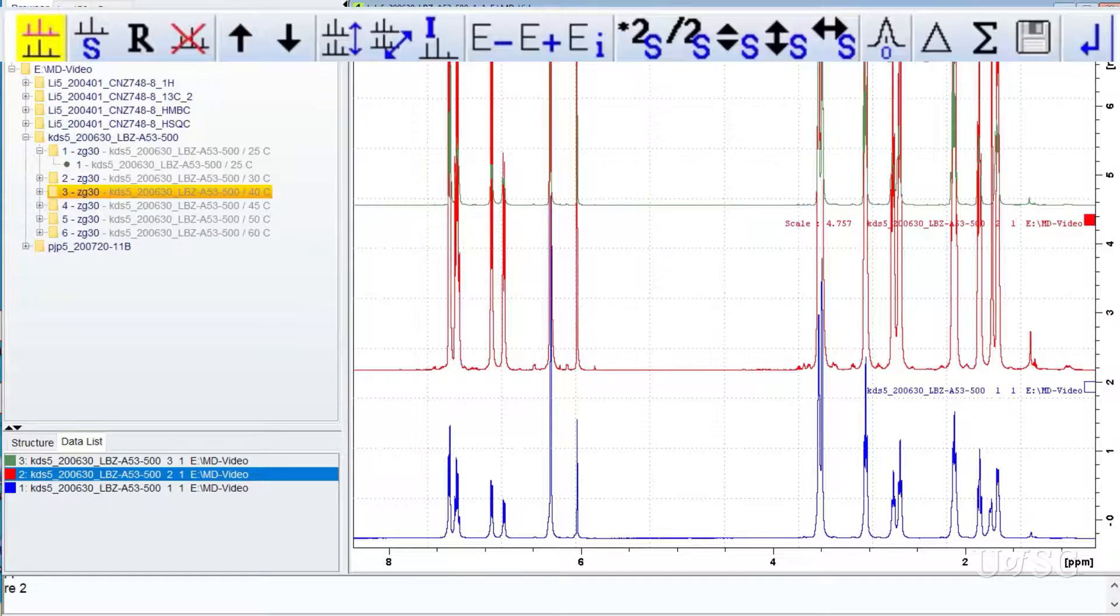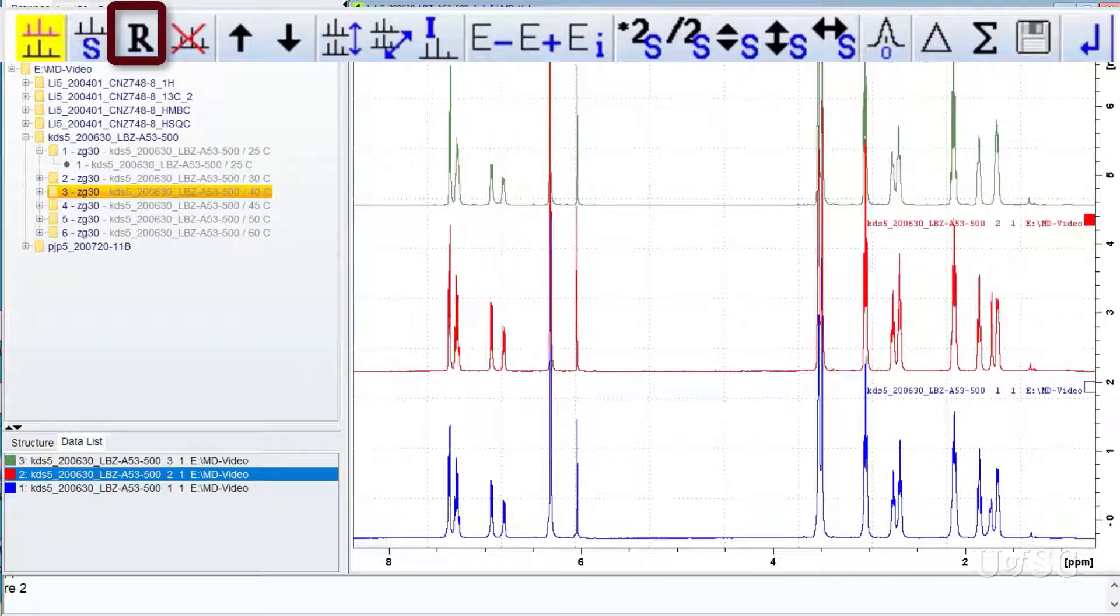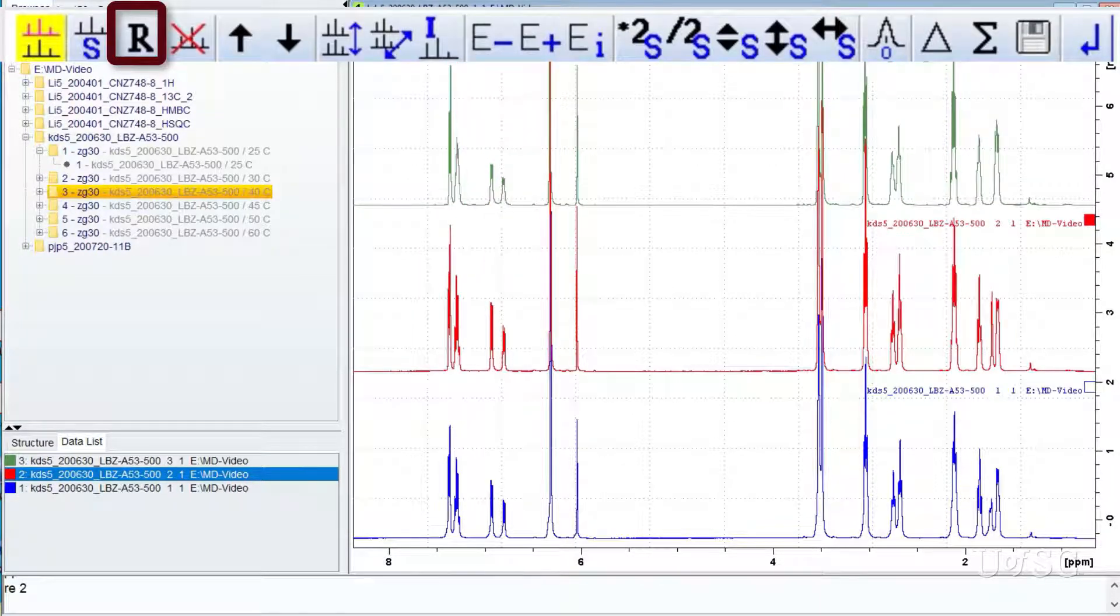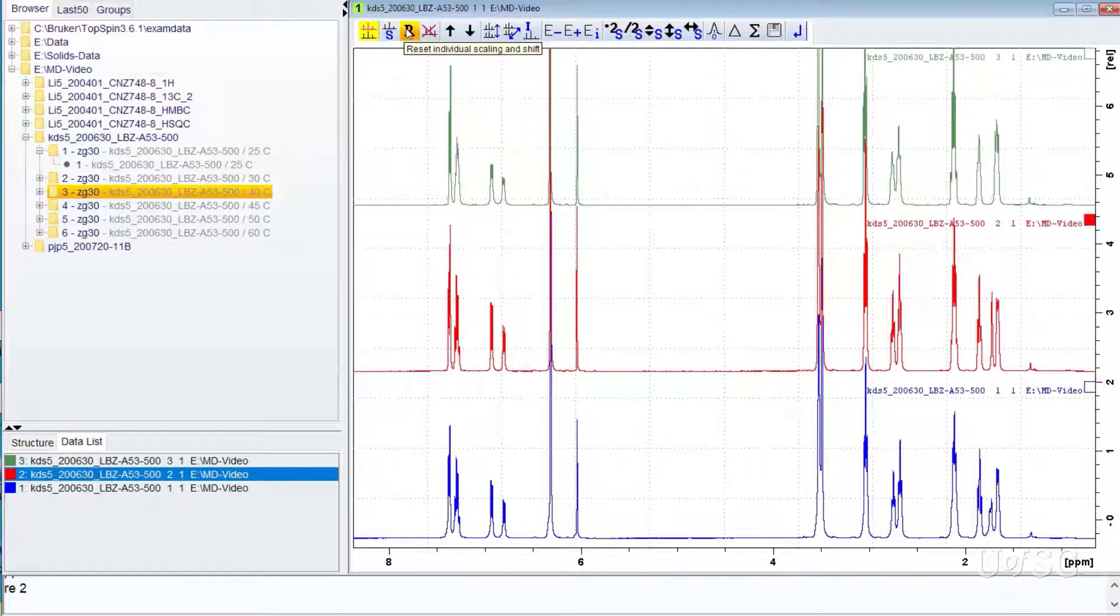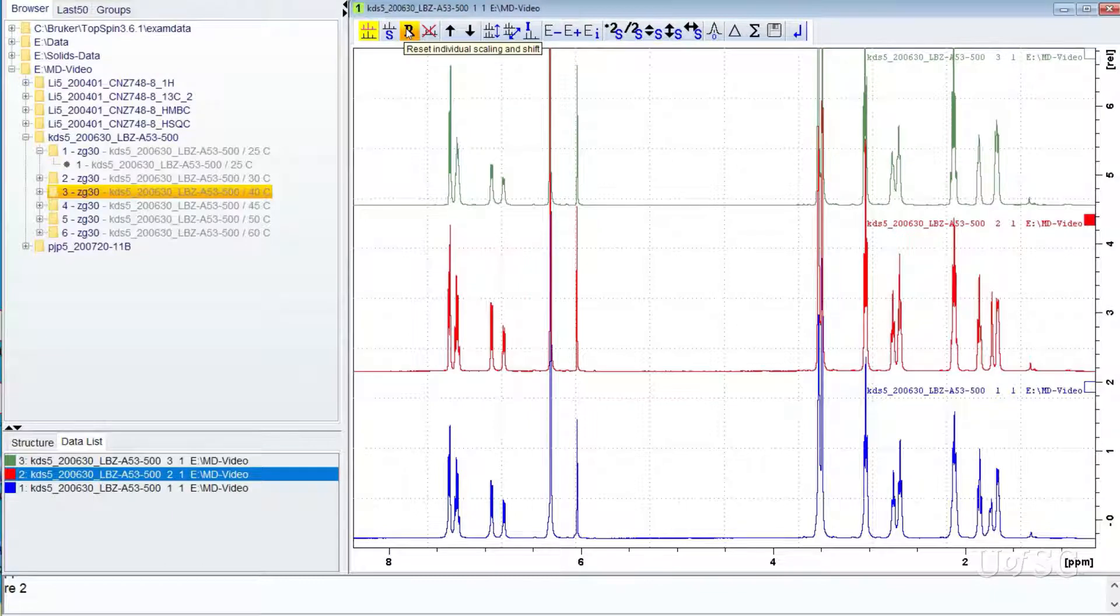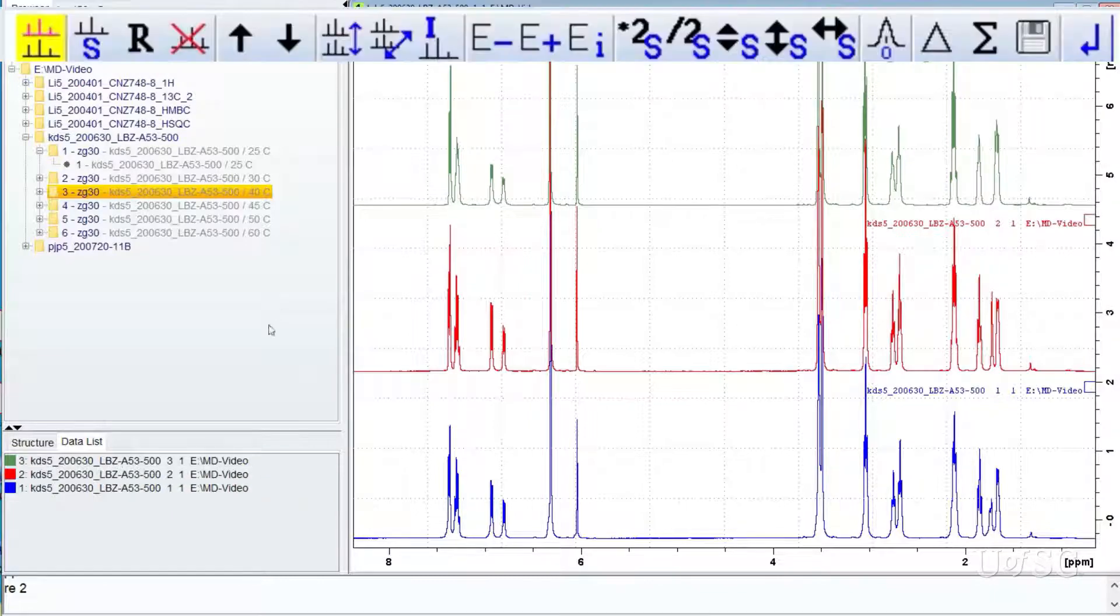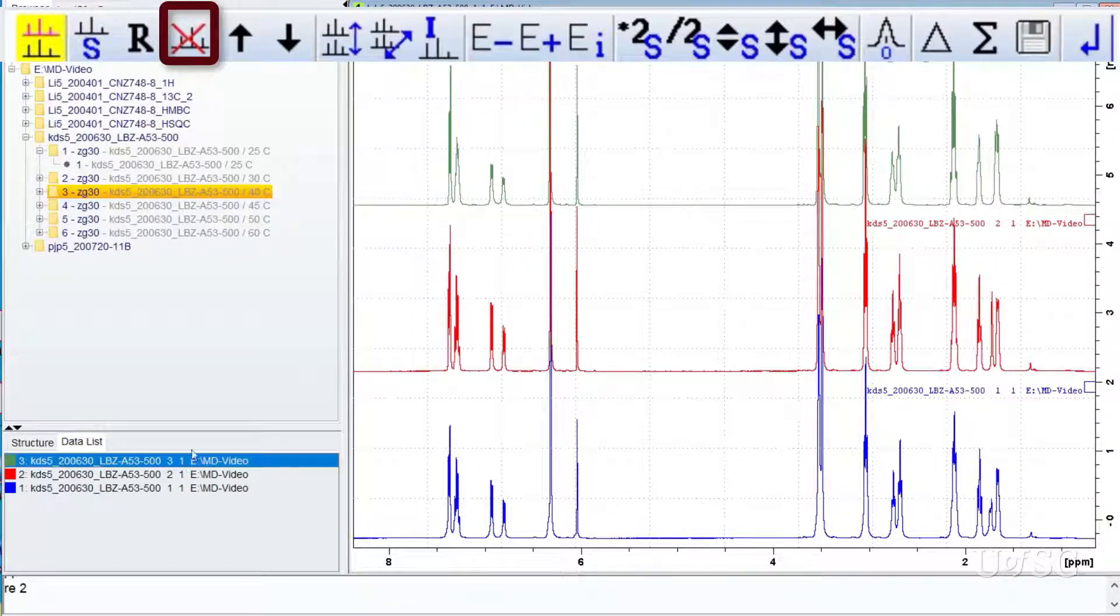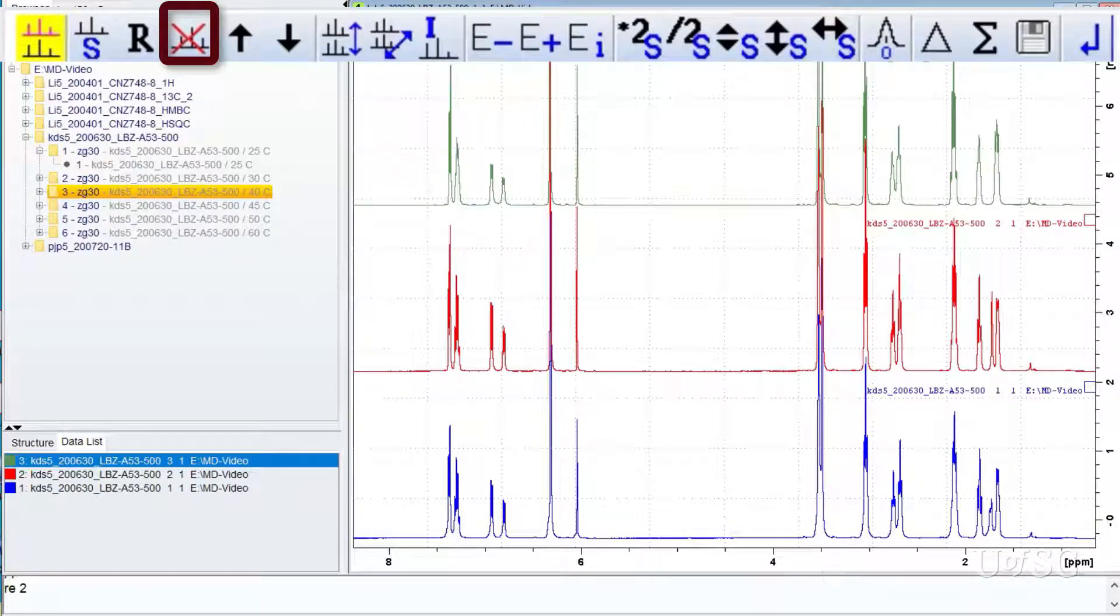The button with the letter R will reset the scaling and shifts back to the original values. Selected traces can be removed from the display with the icon that has the red X.